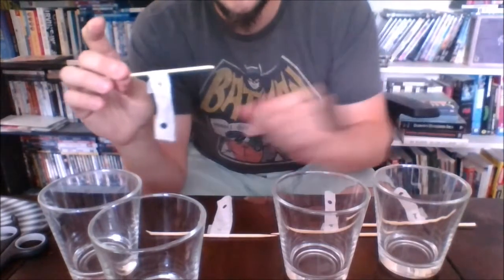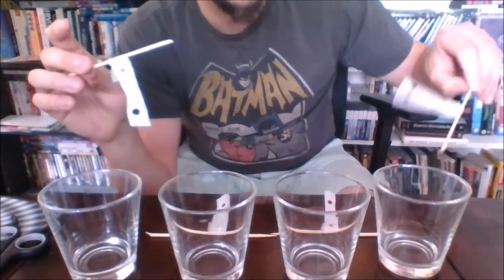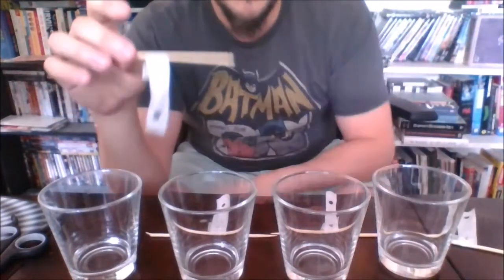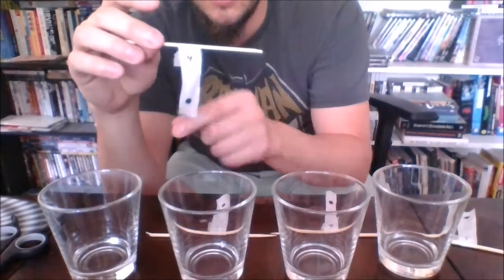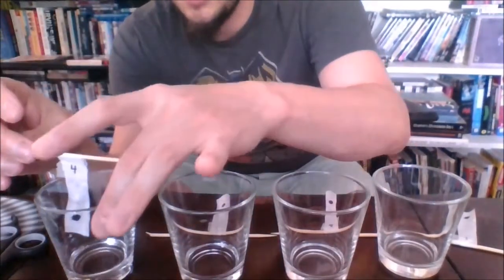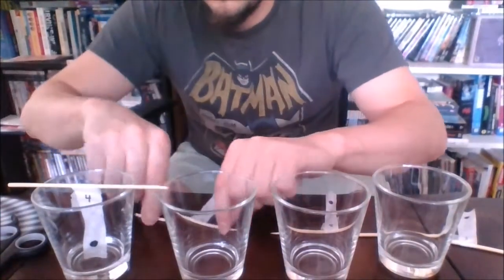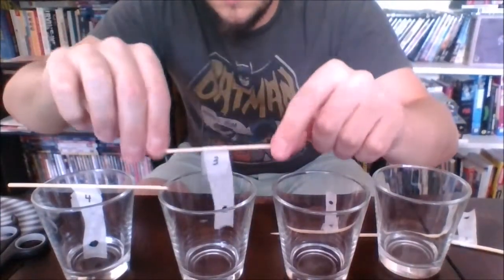Each one of these is going to be hanging in the acetone just enough that the bottom of the paper is touching the acetone and getting soaked, but not so much that it's making its way to the ink on the page. Let's hang them and show what happens.